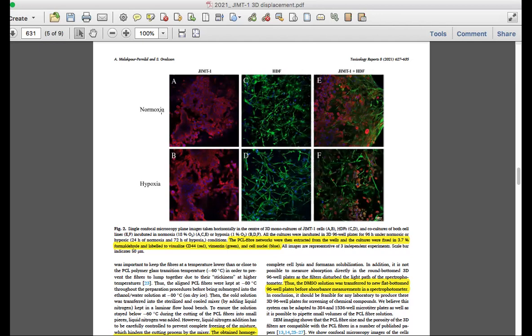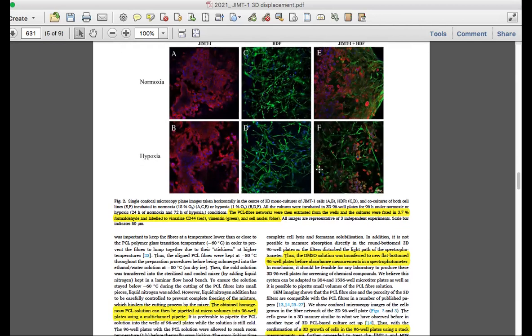So 2 types of cells were cultured, and also 2 conditions were used. The first one is normoxia, and the other one is hypoxia. It's important to study hypoxia because in tumors, there are places where there is lower oxygen concentration, and that's why they use hypoxia in order to evaluate these 2 compounds. The compounds are paclitaxel and another drug that inhibits the growth of cancer stem cells.